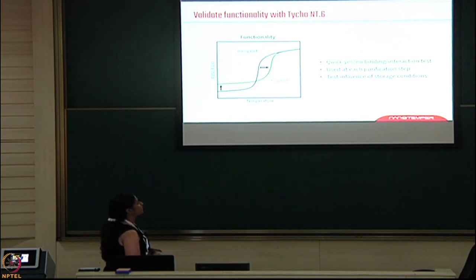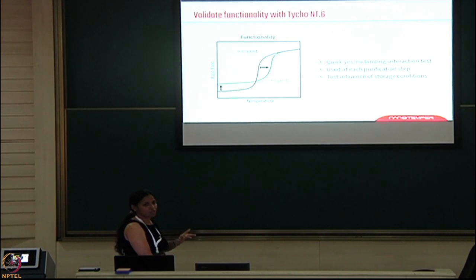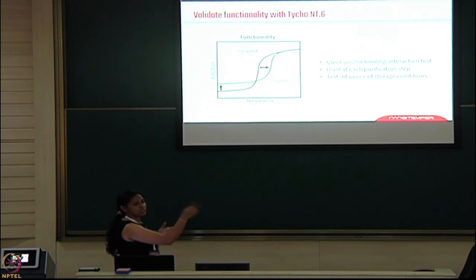Now here you can also check the thermal shift assay. If you have a protein and want to check whether the protein can bind with a particular ligand or not, you run the protein without the ligand, and you will see a particular profile, and then in the presence of a ligand, the shift will change. The shift can be either a positive shift or a negative shift. If it is a positive shift, that means it's a true binder. If it's a negative shift, that means it's not a true binder. We can actually go for a yes or no, whether the shift is happening or not, I mean, whether the interaction is possible or not. With this, you can go for further assays, like SPR or ITC. You can say that this protein with this ligand is good because there is the thermal shift, because the TIs are shifting here.